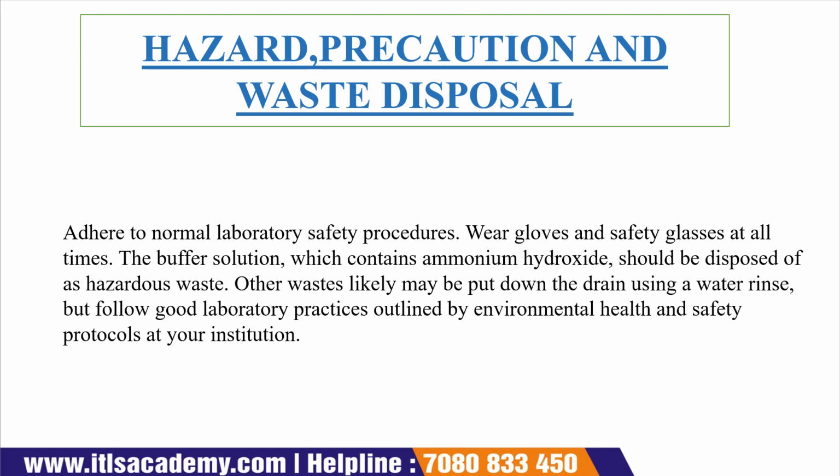We have to avoid the chemicals coming in contact with our skin and clothes. We have to take care so that environmental health is maintained, and we also have to follow the protocol of our institute.